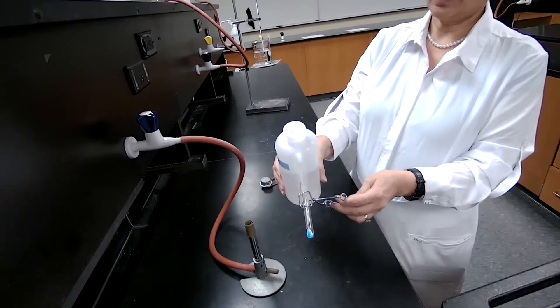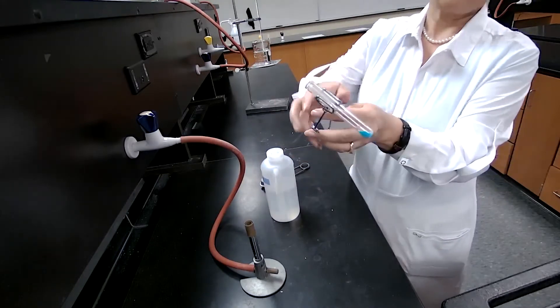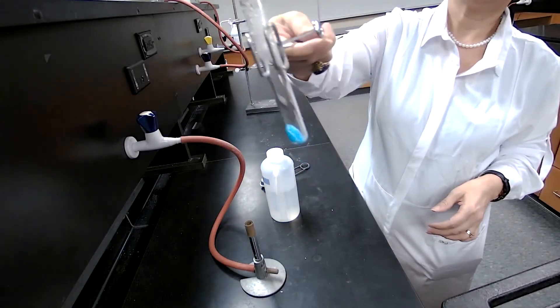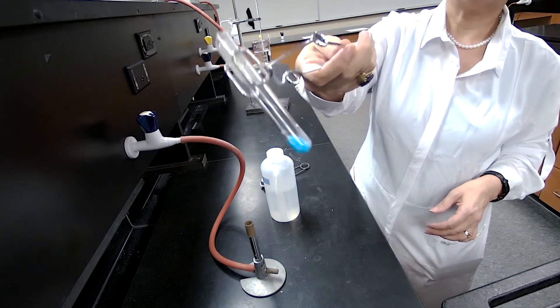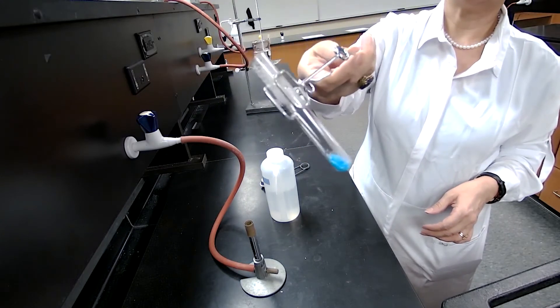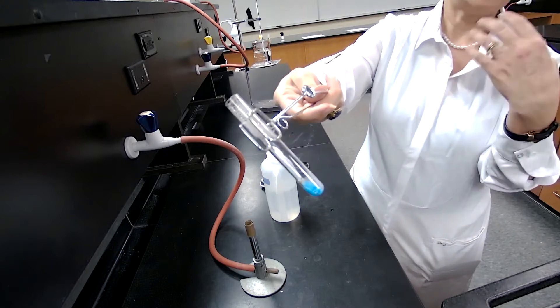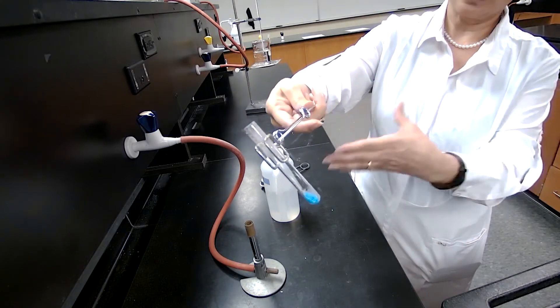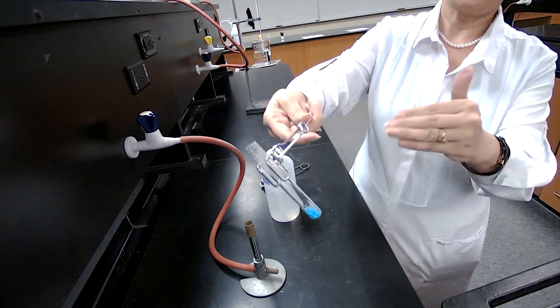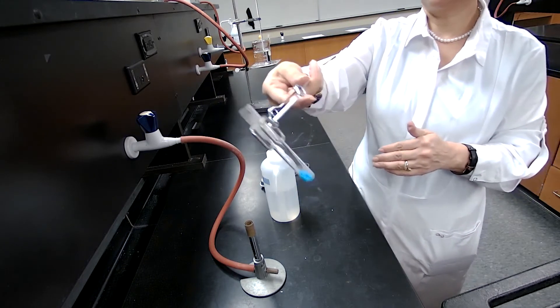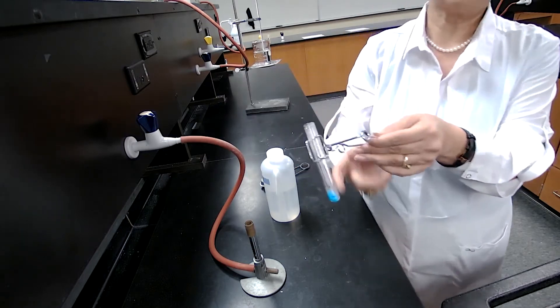So by adding water, a drop of water, the purpose of this experiment is for you to see that the blue color comes back. And this is a reversible process. The water of hydration left as a result of heating, it came back after I add water to anhydrous copper sulfate, which was the white color.